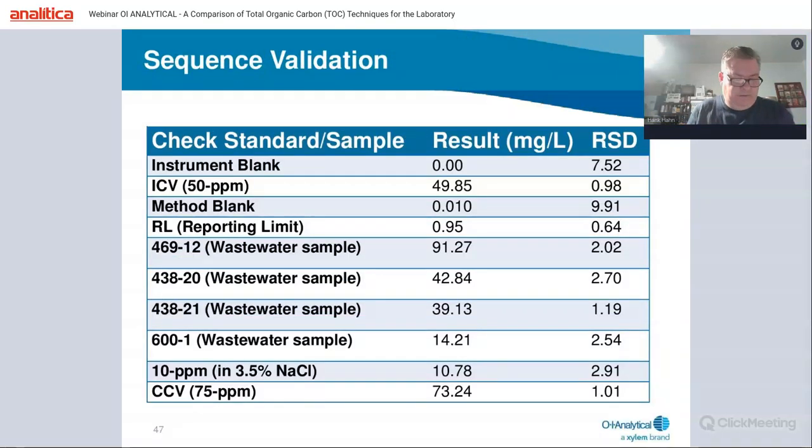And these are results from a sequence that was used to validate the previous calibration. This is a typical sample sequence. It might be used in a service contract, municipal, or industrial laboratory.